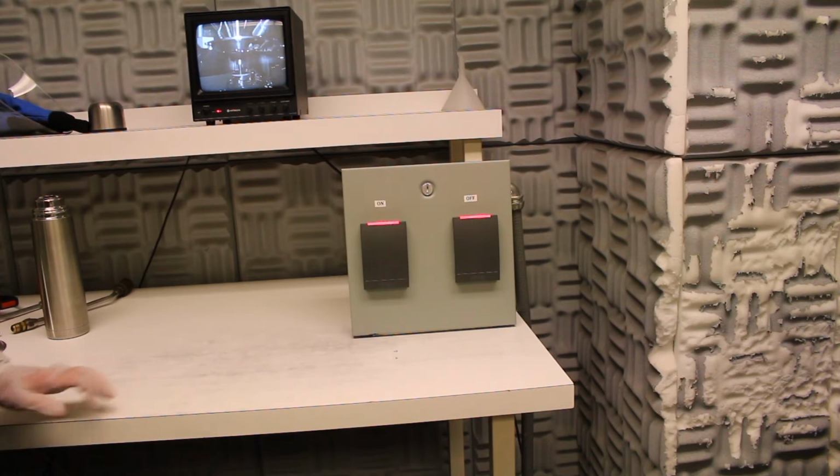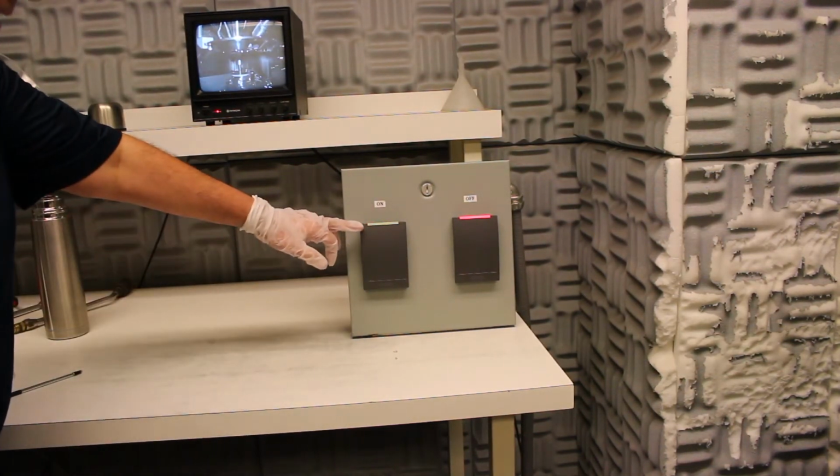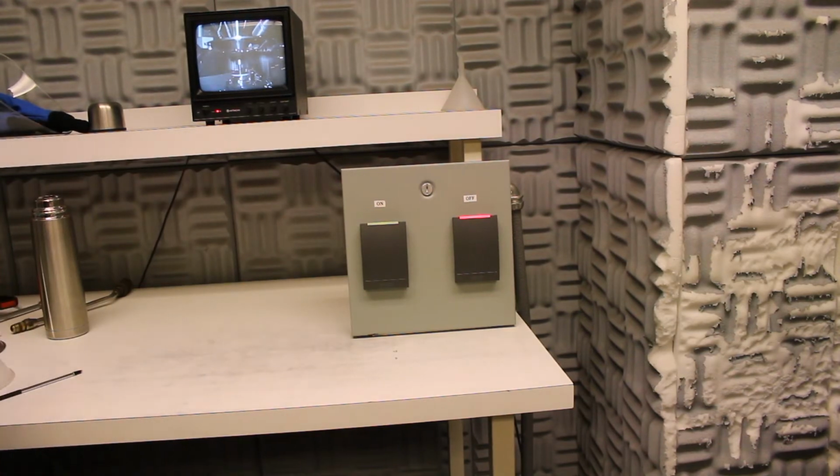Once you have your sample loaded, go ahead and swipe the Isaacs on. It'll go from red to green. This will allow you to turn on the high voltage because it is interlocked. When you're done, of course, you will then turn it off.